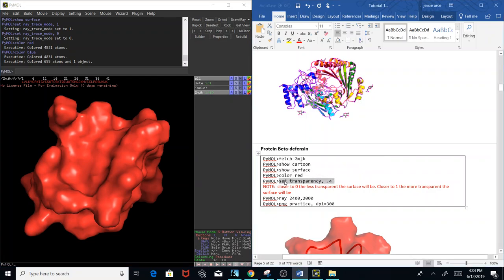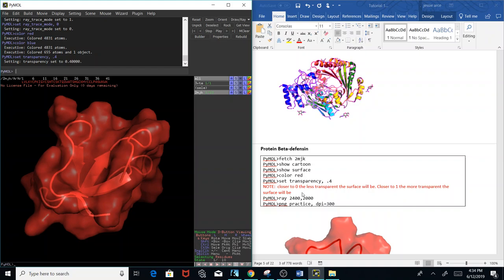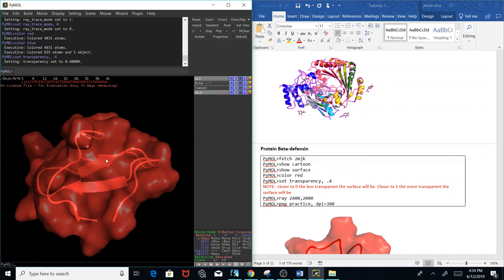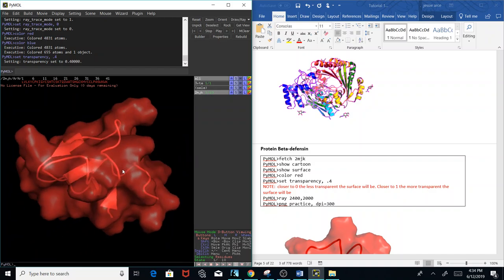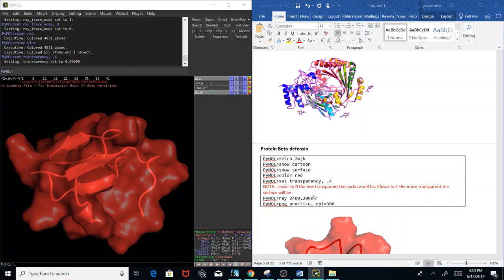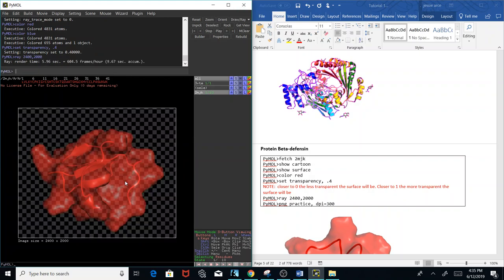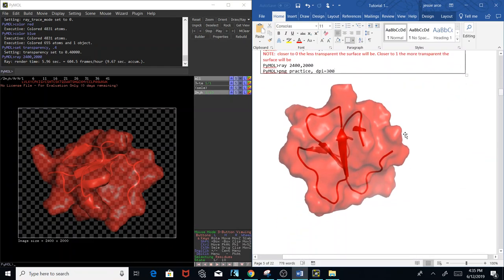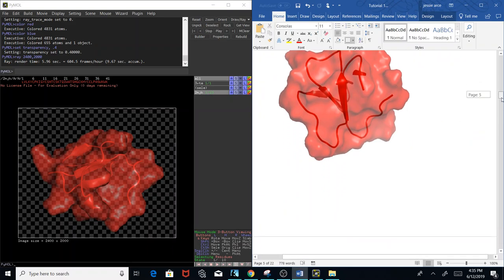I'll set the surface transparency to 0.4. The closer to zero, the less transparent the surface; closer to one, the more transparent. Setting the surface to transparent lets you see the cartoon representation of the protein through the surface. Then I set the image size with 'ray 2400 2000', and save the picture using 'png', naming it and specifying DPI. Here I have the picture inserted into the document.